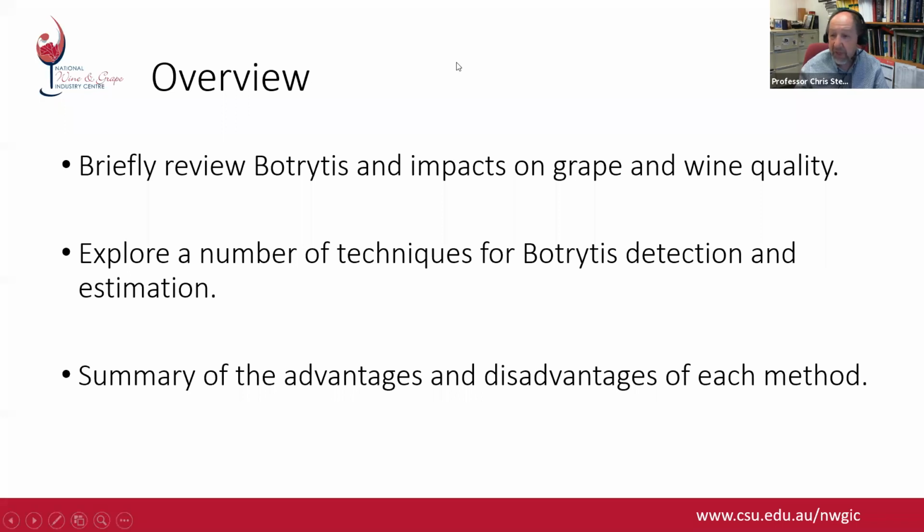For the bulk of the presentation, I'm going to be exploring the techniques that we've developed or looked at for botrytis detection and estimation. Some I'm going to concentrate on a little more than others because we've done more work in that area.